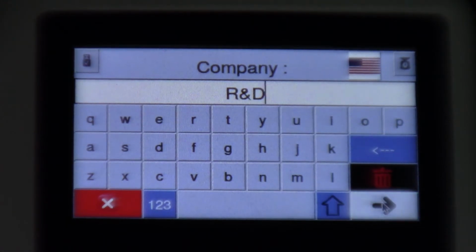and then we progress. Now, this you do not modify because this is the user that you've signed in with. So we're signed in as an admin. That's how we're working it. Sample. We're just going to call it test. Let's call it test 1.